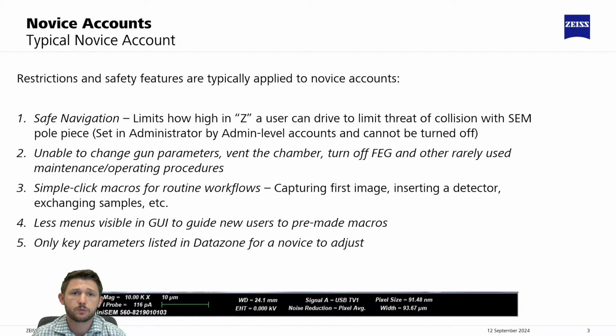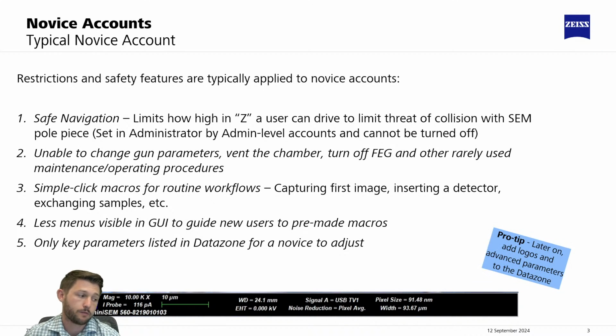And then, of course, the data zone, which is immensely powerful when you're doing your imaging for accessing and toggling specific settings on the fly, would have just the bare bones parameters that are necessary for operation. And of course, later on, as the folks get more experience, this is maybe the first area for customization for those novice users, perhaps throwing in a logo for the lab or department of the company that's using the tool, or adding some different parameters that are commonly used as well.